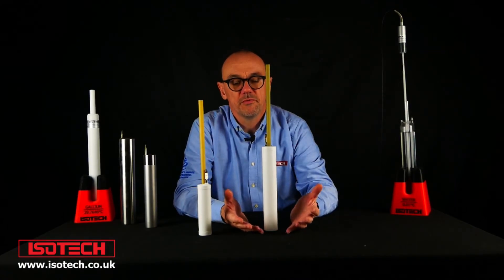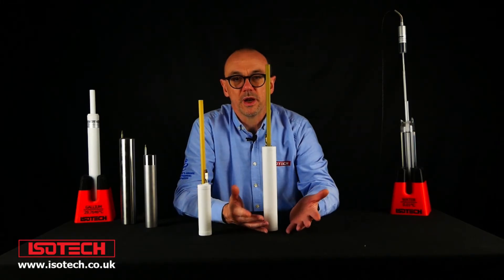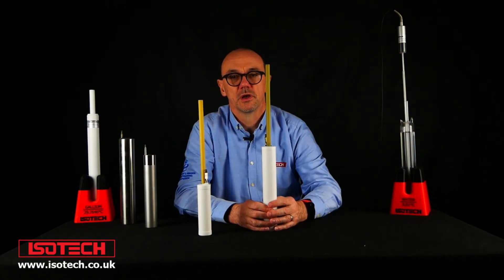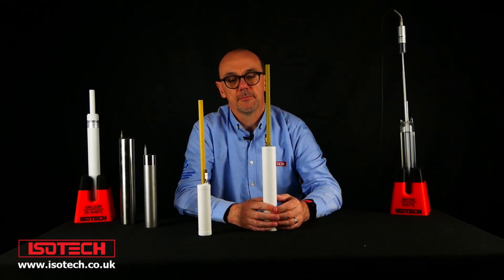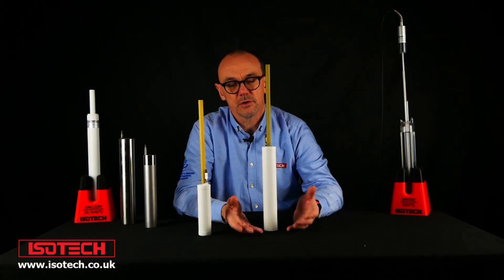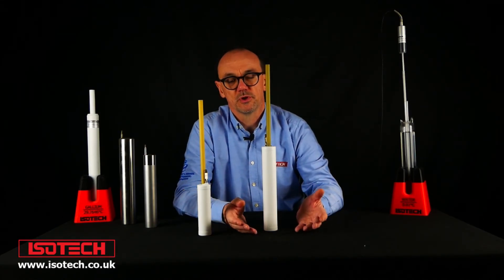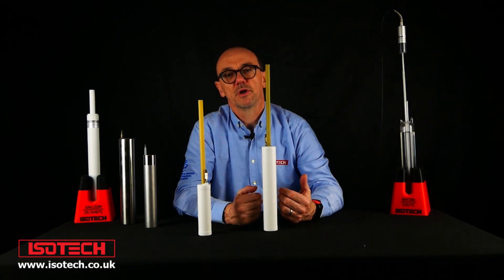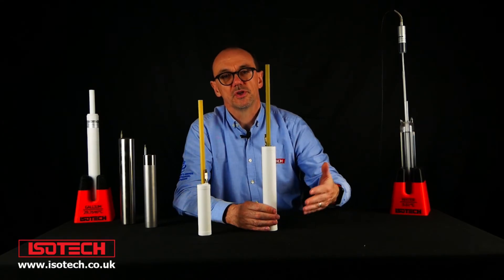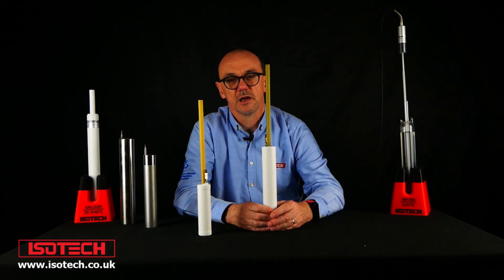Some practical tips about storage of mercury cells: they're quite easy to store and we store ours vertically, normally leaving them in the apparatus or keeping them in a secure cupboard. They're not so fragile compared to some of the other cells. If you need to transport a mercury cell you don't need to worry too much, other than the fact that mercury itself is classified as hazardous, so special regulations apply when shipping a hazardous substance. In terms of the safety of the cell itself, it's fairly assured.